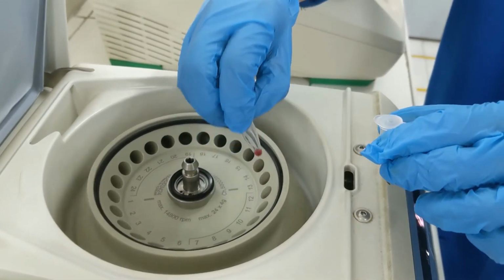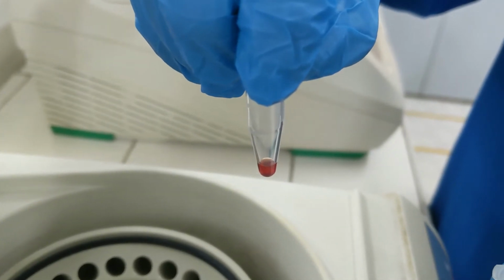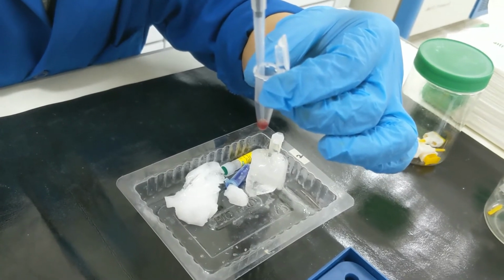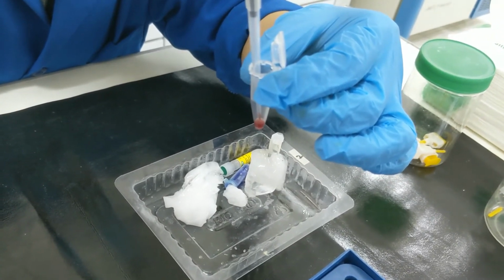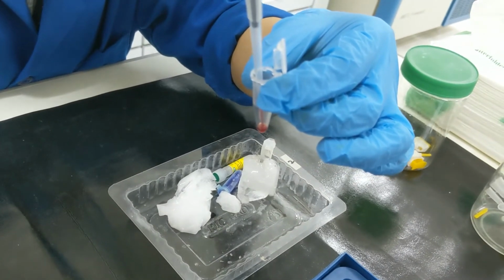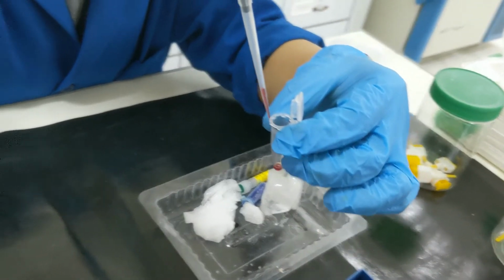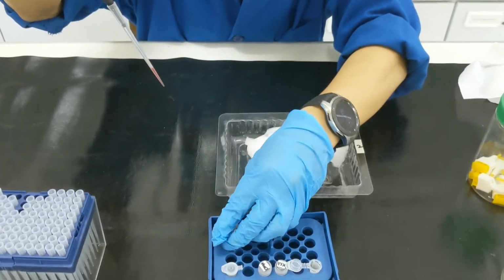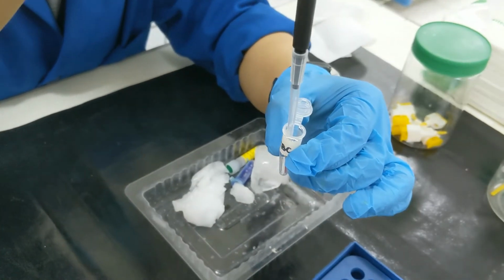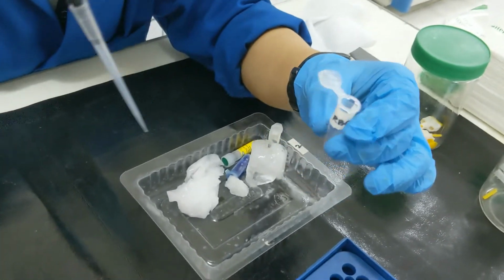Okay, so let's see what happened to our sample. So we can see here that the supernatant is actually not clear now. It's reddish, and we are expecting that the blood cells, usually the red blood cells, have lysed, and that the proteins are now here in the supernatant. So we will be aspirating the supernatant, leaving the pellet behind. And we'll transfer this to another microcentrifuge tube, and this will be our cell lysate sample.